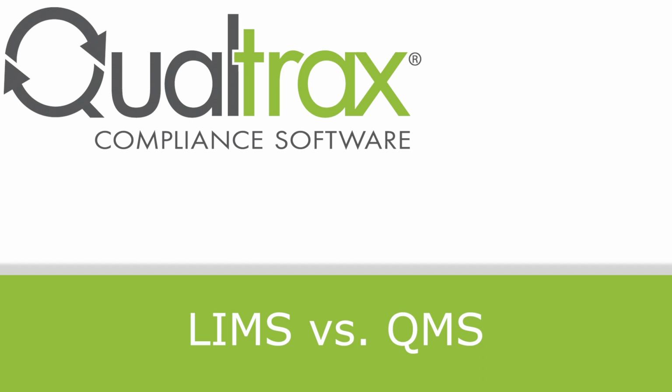A LIMS is a laboratory information management system. A QMS refers to quality management system, or sometimes referred to as an EQMS, electronic quality management system, or a compliance management system. In a laboratory setting, there is a plethora of data that needs to be tracked. Very important work is being completed on a day-to-day basis, and a system needs to be able to help a laboratory efficiently capture that simple analytical testing data. It needs to be able to provide traceability for the results, track the items that are used during the testing process back to lot numbers, and be able to validate and QA that data to ensure its accuracy.